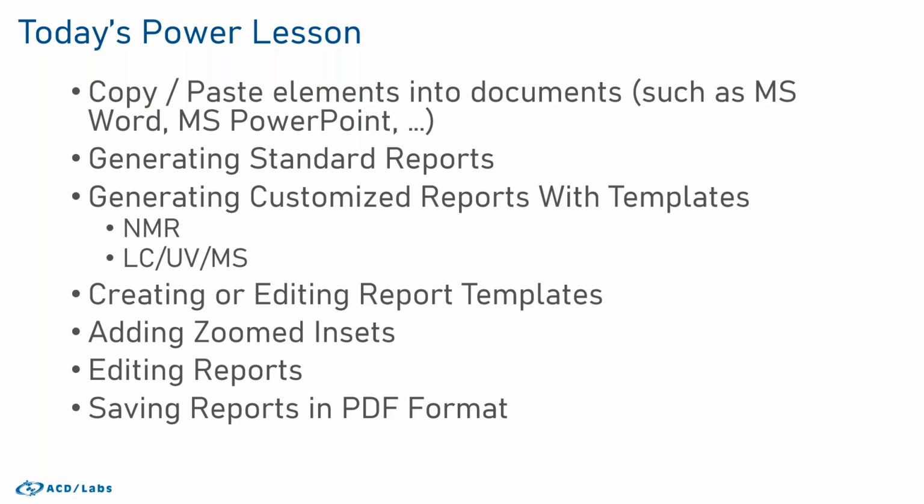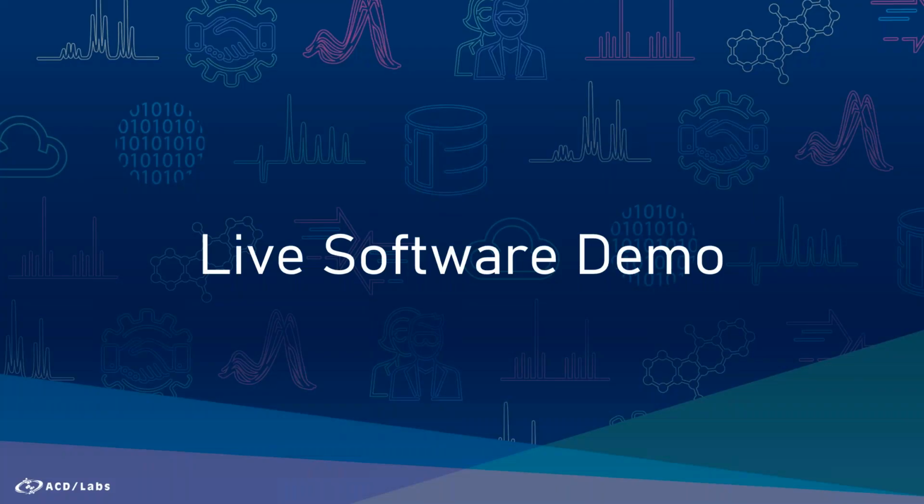We're also going to talk about creating or editing the report templates. Eddie will also go over adding zoomed insets, editing the reports, and saving reports in a PDF format. So I think with that out of the way, Eddie, if you're ready to go, I'll hand you over presenter mode and you can get started.